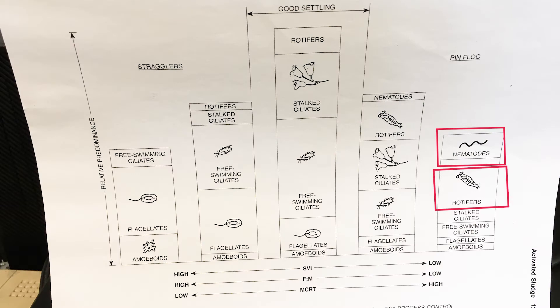Over here if you have pin flocking with nematodes and rotifers you have older sludge that is too old and you need to waste more. You have way too much bacteria in your treatment plant. You'll have pin flocking and straggler flocking with TSS going out your effluent. It won't look pretty and it won't be really clear.